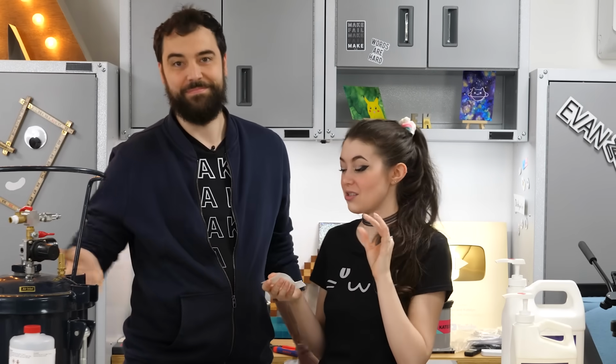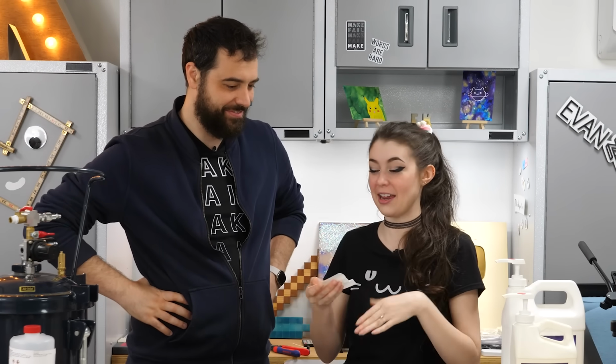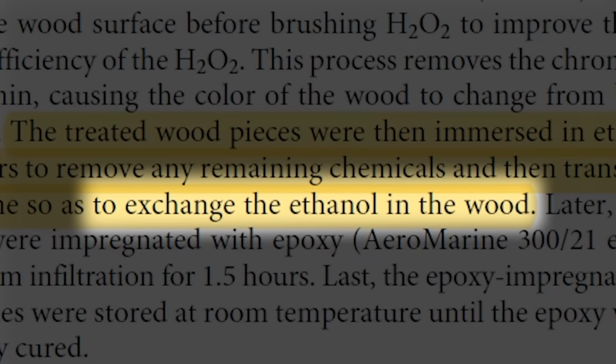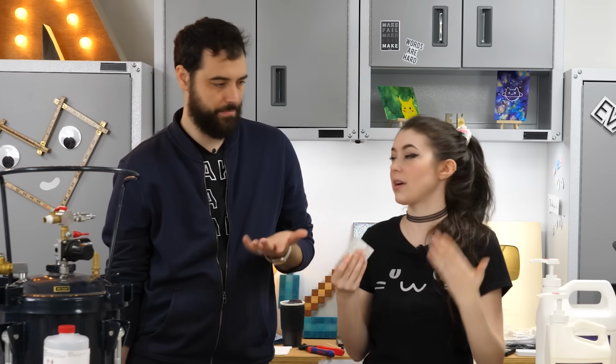We did do some research this morning before looking at this, and we have a safety net set up. We looked through the paper and saw that one thing they used that we kind of disregarded in the beginning was this chemical called toluene. In the paper it looked like they used it to rinse out the alcohol because it evaporates faster than alcohol. So it seemed like just a quicker way of drying it.